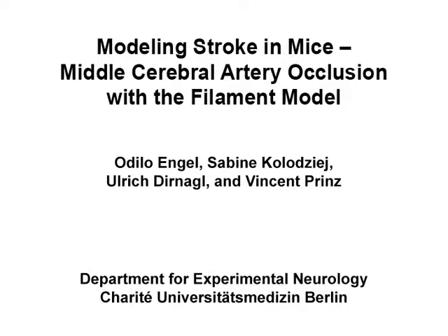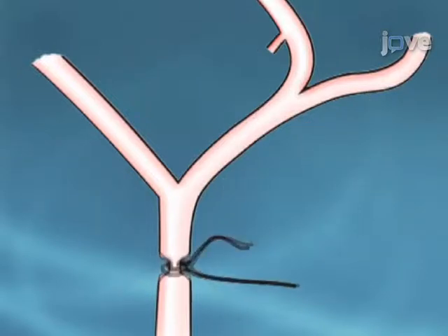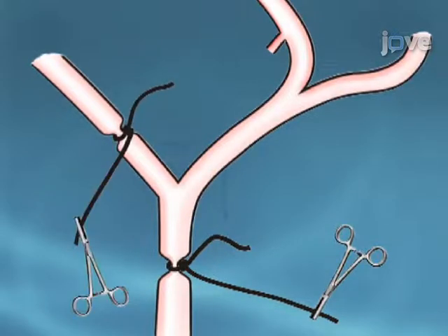The overall goal of this procedure is to produce a mouse model of focal cerebral ischemia by blocking the middle cerebral artery with an intraluminal thread. This is accomplished by making a midline neck incision and visualising the common carotid artery. The next step is to tie ligatures around the common carotid artery and the external carotid artery. Clamps are used to keep them in place and to prevent bleeding.